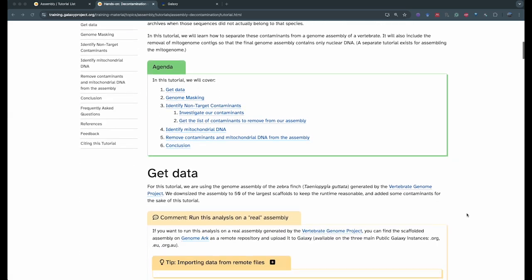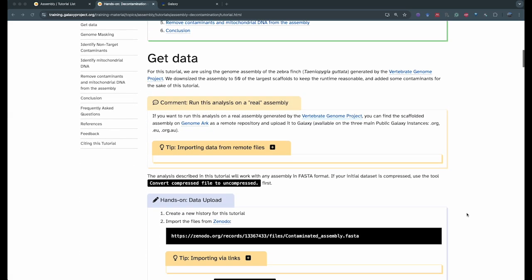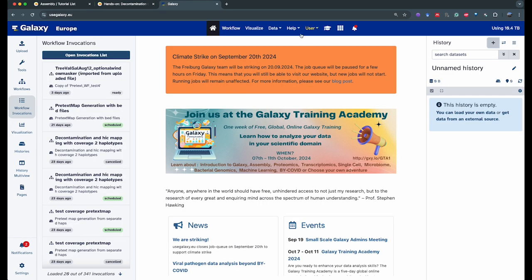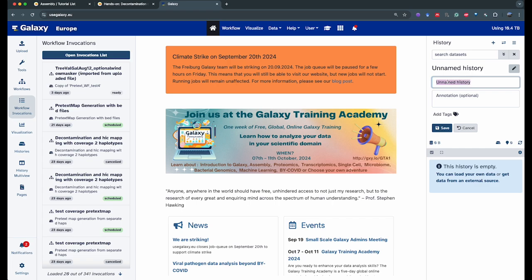The first thing we're going to do is export the data into Galaxy. The only thing we need is the assembly FASTA file. If you don't have an account yet, please create an account and connect to it. We're going to create a new history by pushing on the plus button if you already have a working history, and we're going to name it 'decontamination'. You do that by clicking on the little pencil next to the history name, typing decontamination, and clicking on save.